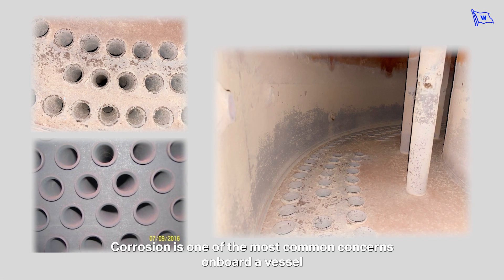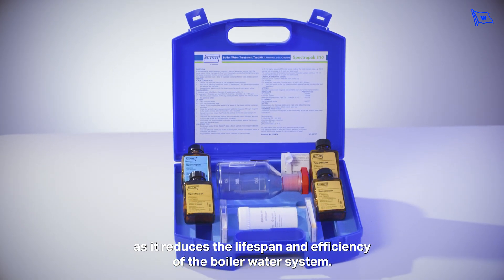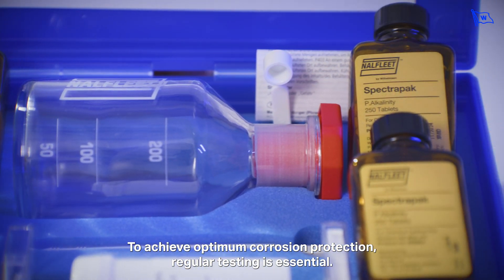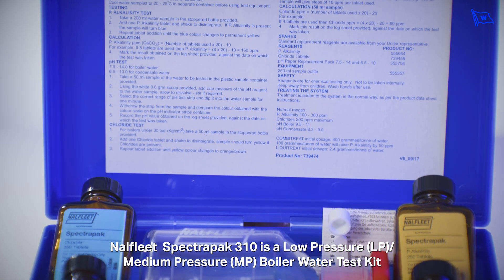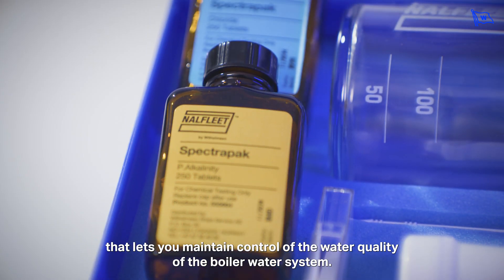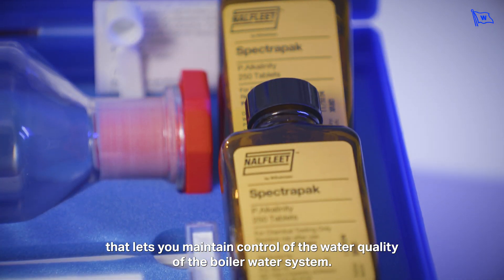Corrosion is one of the most common concerns on board a vessel as it reduces the lifespan and efficiency of the boiler water system. To achieve optimum corrosion protection, regular testing is essential. Nalfleet SpectraPak 310 is a low-pressure, medium-pressure boiler water test kit that lets you maintain control of the water quality of the boiler water system.